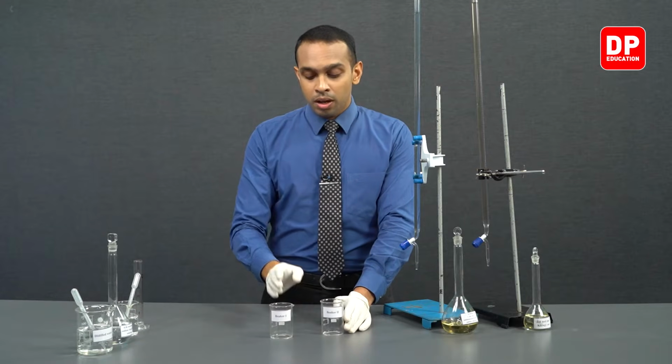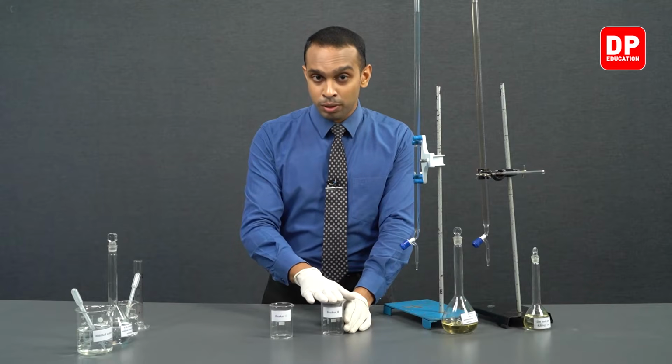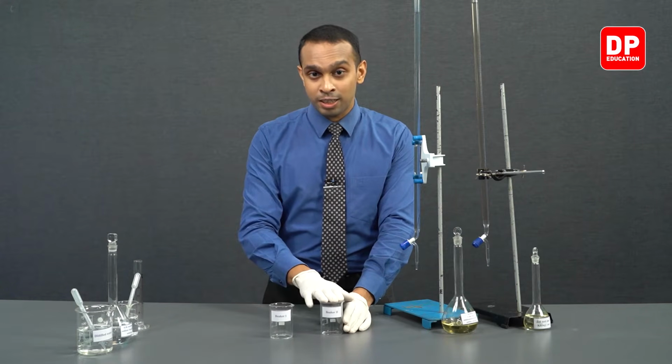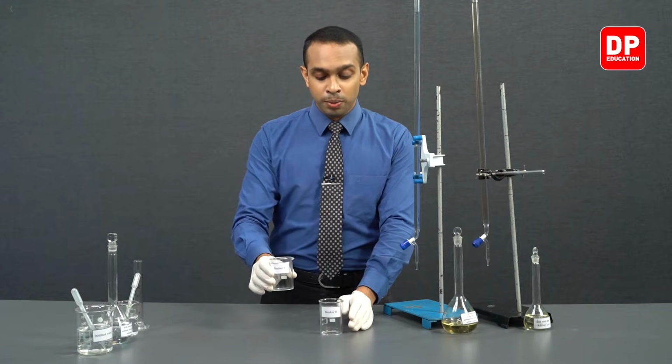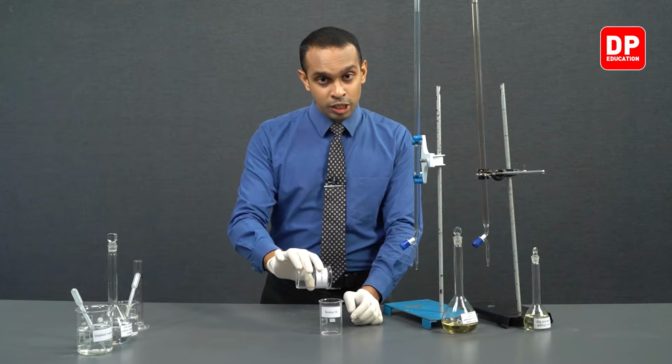Then after we add potassium iodide and a very specific amount of sodium thiosulfate, we are going to add starch indicator here as well. And then we will use a stopwatch as well, and then we will mix contents in beaker 1 with beaker 2.